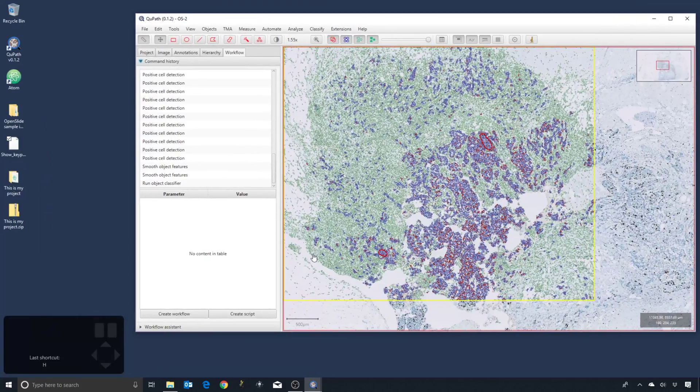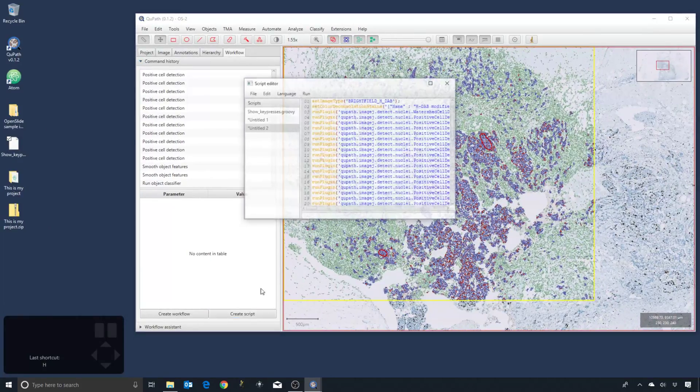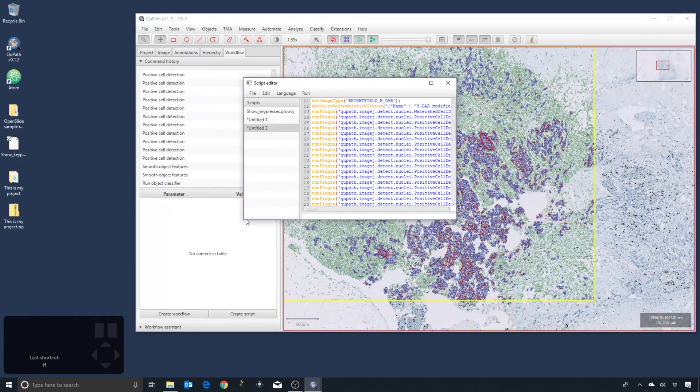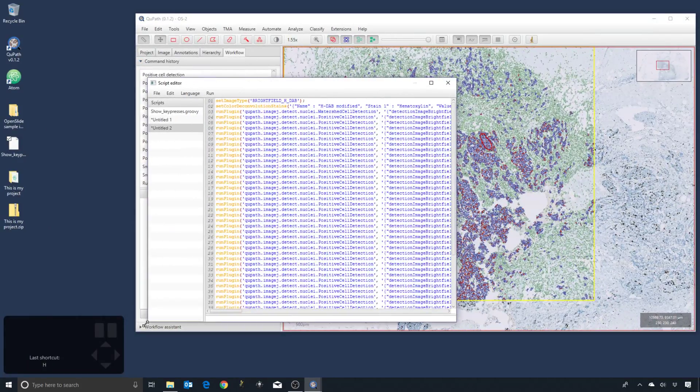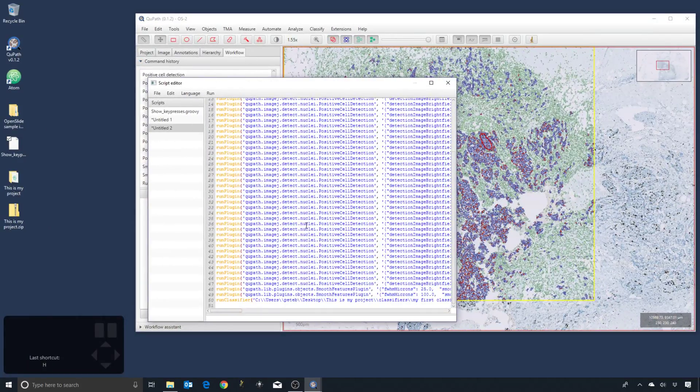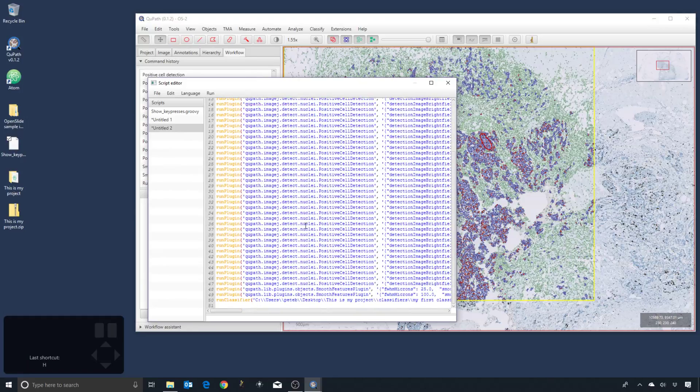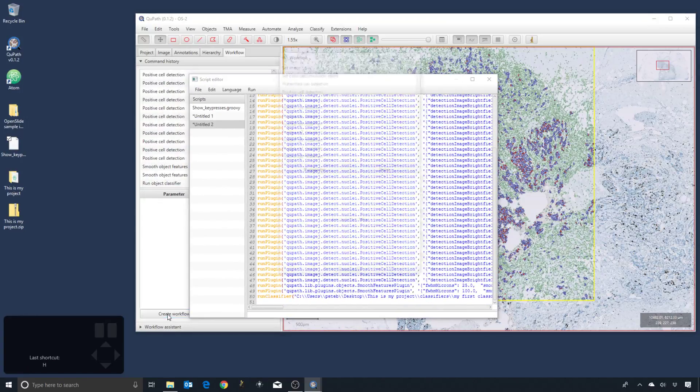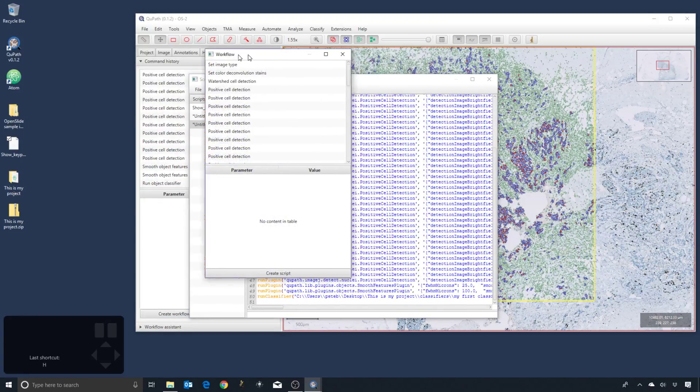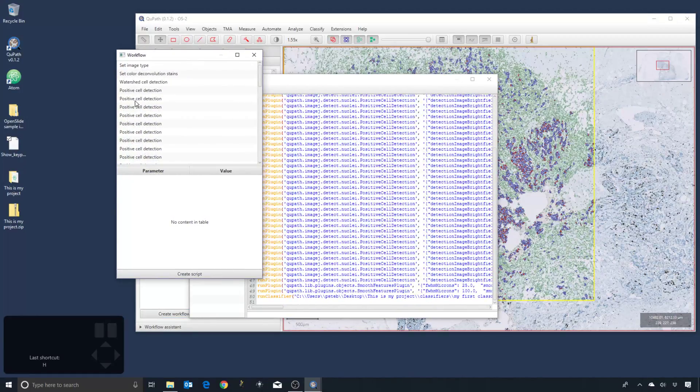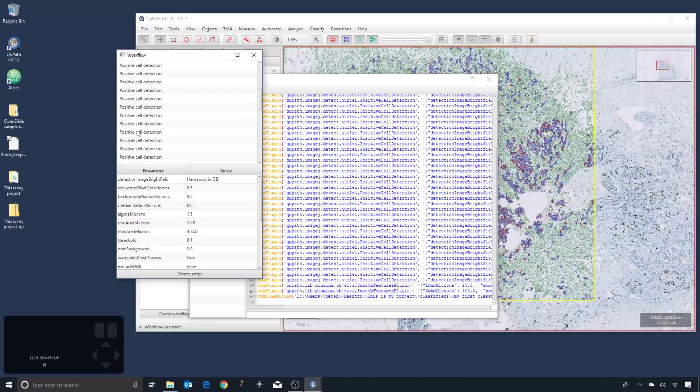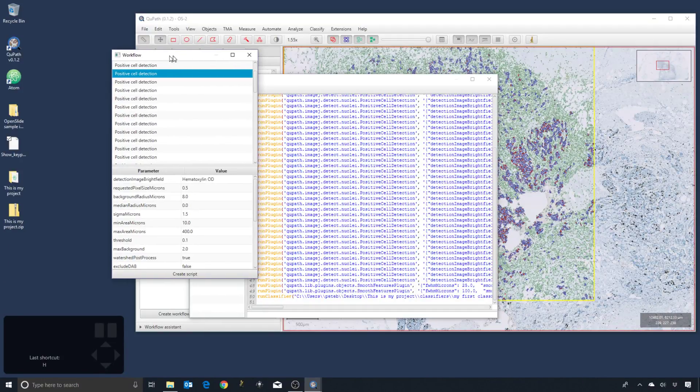So 'Create Script' will create a script which replicates all of the stuff that we did. 'Create Workflow' will give us basically a list of all of the steps. So they correspond to one another.